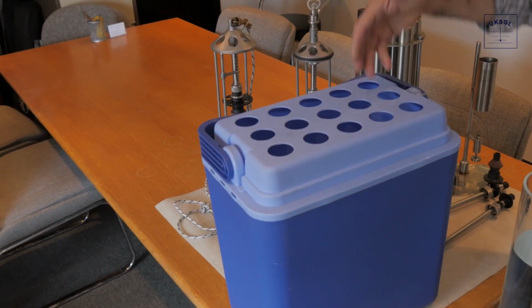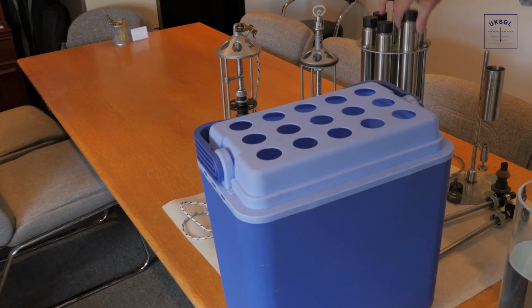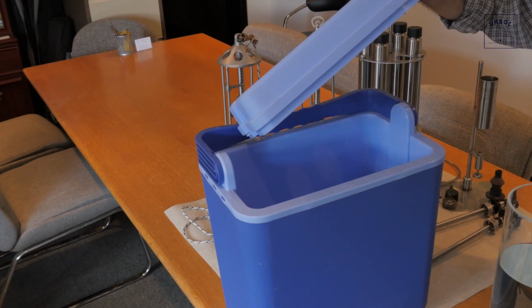A plastic cooling crate is available into which the tubes can be stored. The crate is filled with iced water, and the tubes are placed inside with the black caps at the bottom.